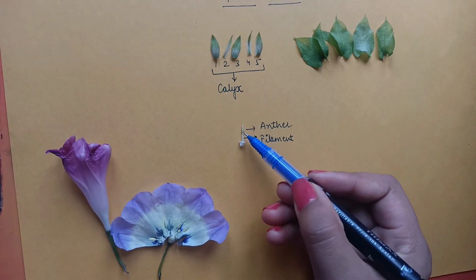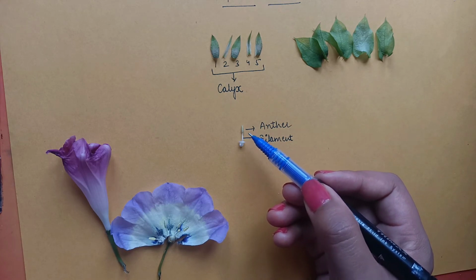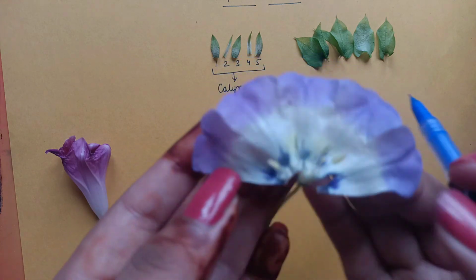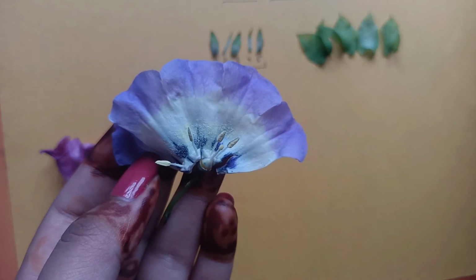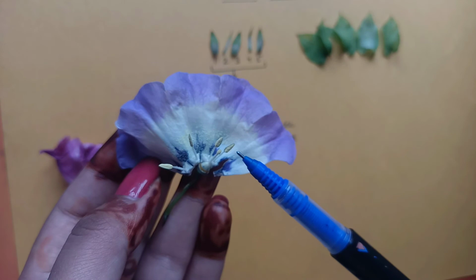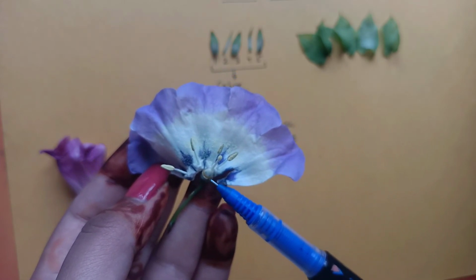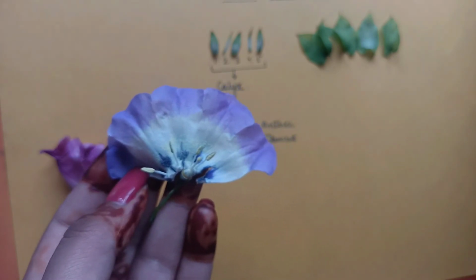So your anther has the pollen grains. You can see this yellow part over here very carefully. This is the head-like structure, and this is attached to your thalamus over here. Then I guess your male part is clear.